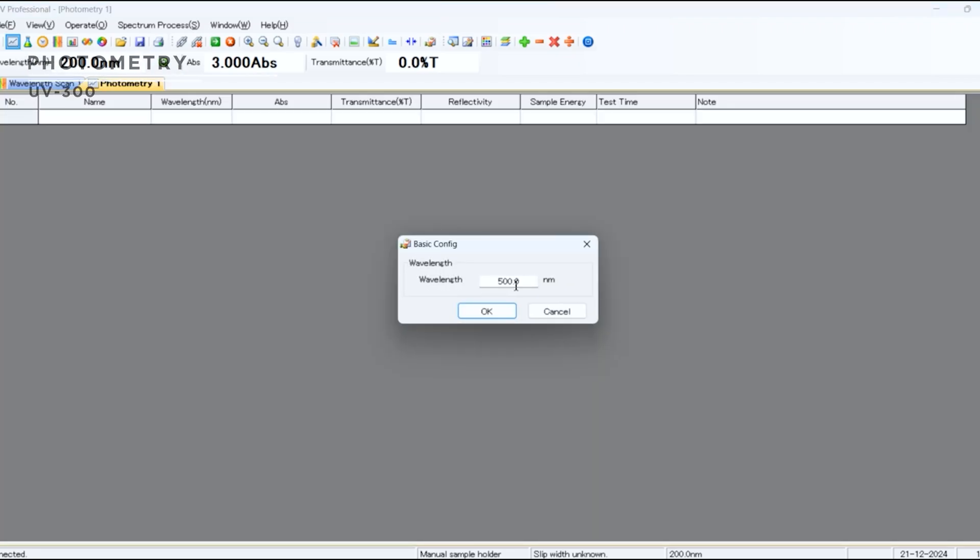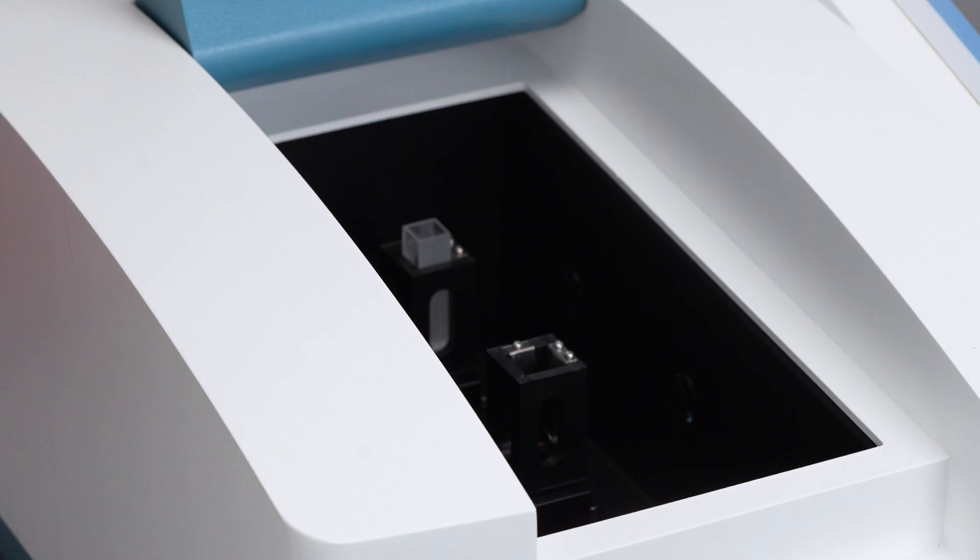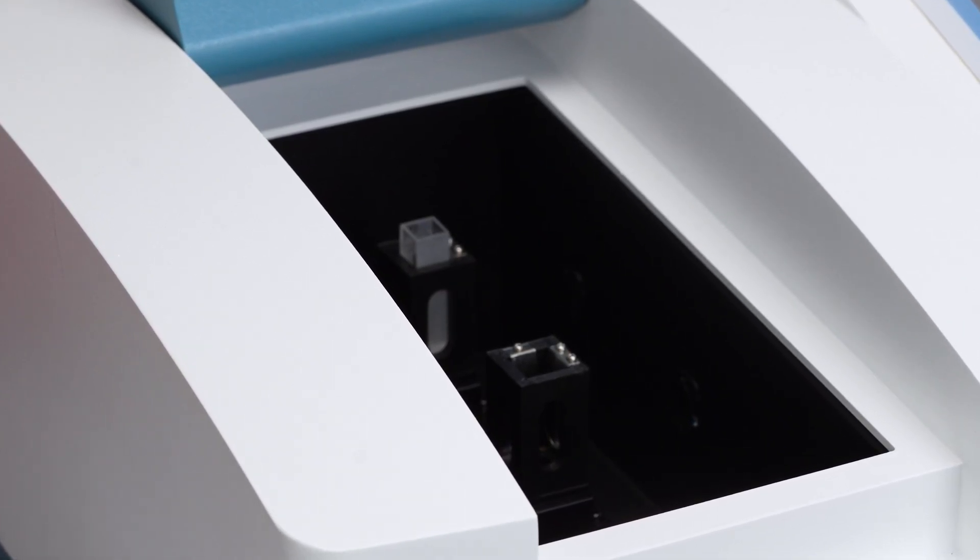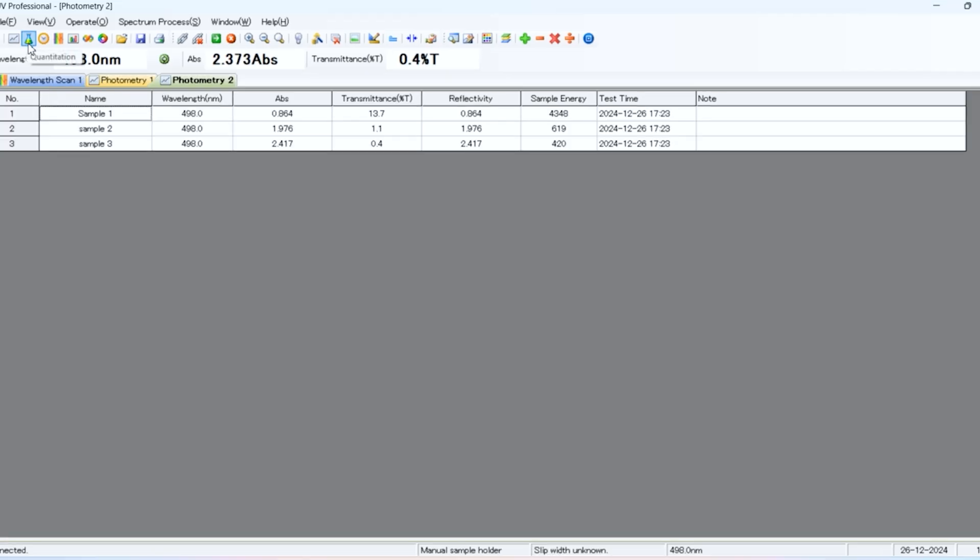Input the desired wavelength and click OK. Place a blank solution in the light source, followed by the sample. Right-click and select start test to measure absorbance for your samples.